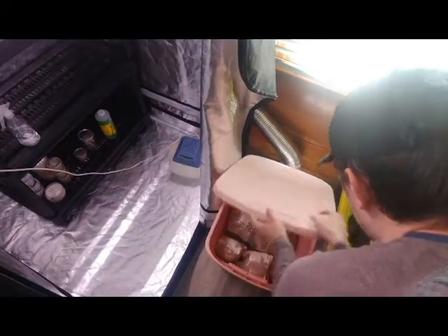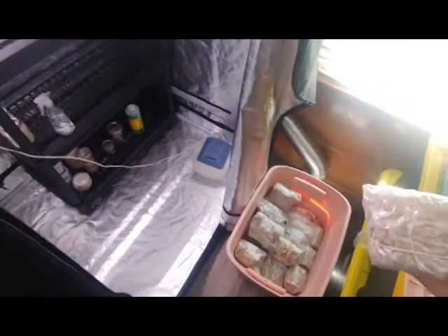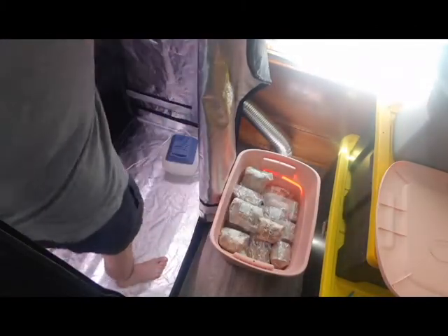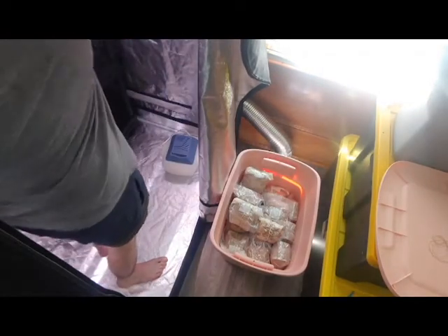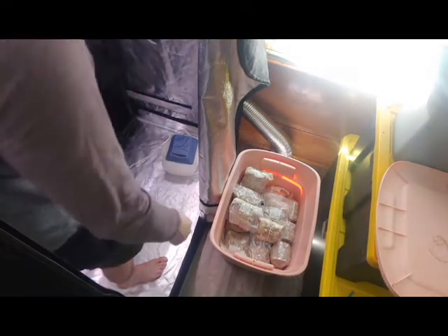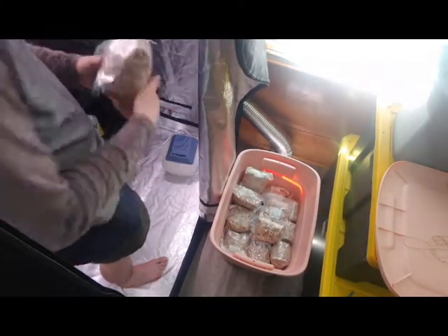This is a study for incubation — I have a few different totes and I'm storing them in a few different ways. This tote was given less oxygen but it was in longer than the previous tote. As you can see they're at pretty equal colonization levels, so I'm deciding to fruit them together. I've not seen any contamination from any of the bags so far — none in the big black totes either. It's pretty significant how little contamination there was and how well the DIY laminar flow hood worked for these bags.